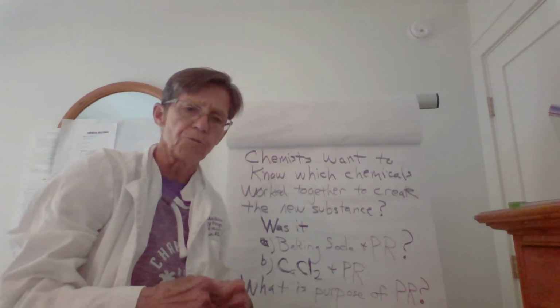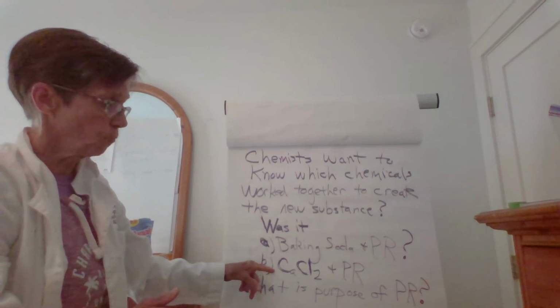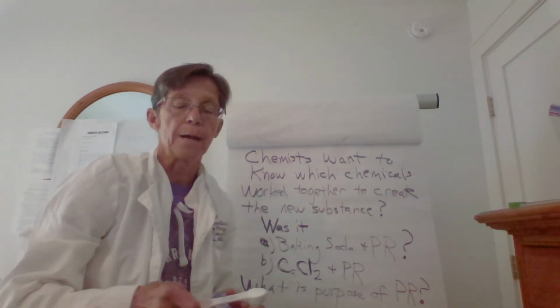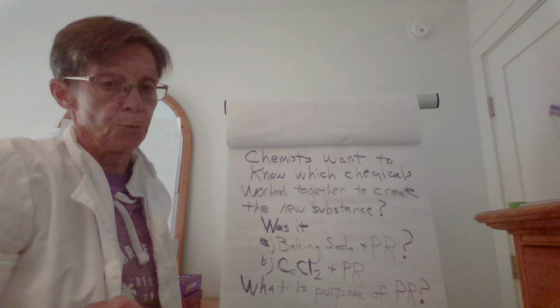So I'm going to pause it. I want you to write down which one you think it is, okay? Which one do you think really caused the gas? All right, I'm just a little pause. Okay, now I'm back. So I don't know which ones you wrote down, okay, but we're going to try both of them just so you can see.